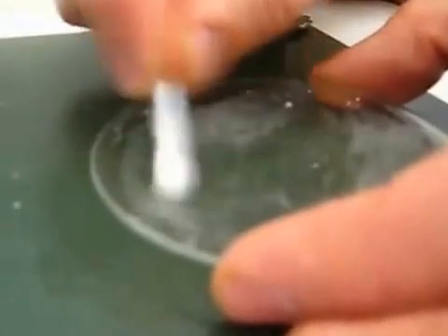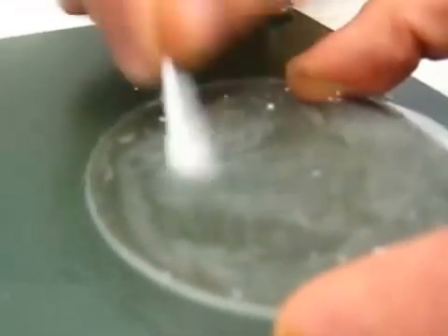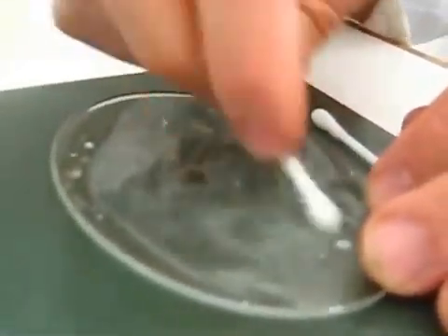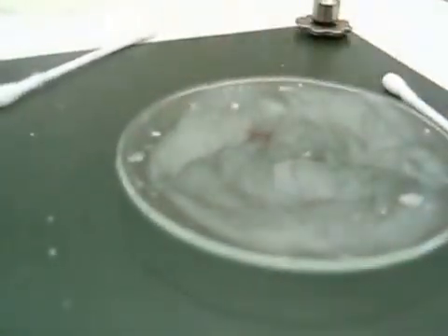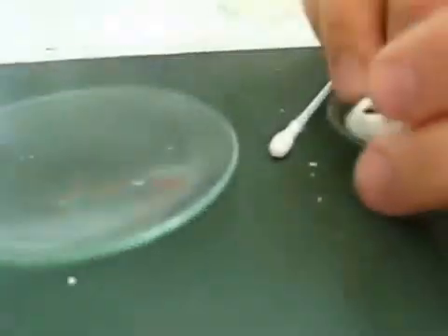Okay, so now let's see if we can dissolve the wax using a Q-tip and this ethanol here. Now you can try to rub it, but it's not rubbing off. And this is important, and this is one reason why you really want to do this lab at home or at school, to actually feel the subtle differences between the different solvents. So let's wipe that off. Let's wipe that off here as well.